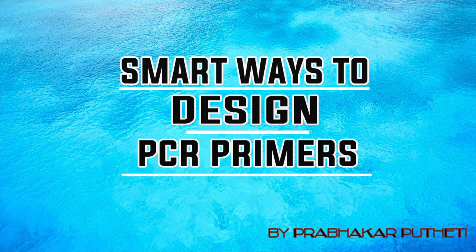Today I'm going to show you smart ways of designing primers for your PCR. There are certain times that you are doing a project on your own gene of interest, but at the same time you want to see expression of certain other genes that you saw in an article recently. And you're not sure that those genes are expressed in your samples. You just want to test it, and in case they are not expressed, you don't want to work with those for long.